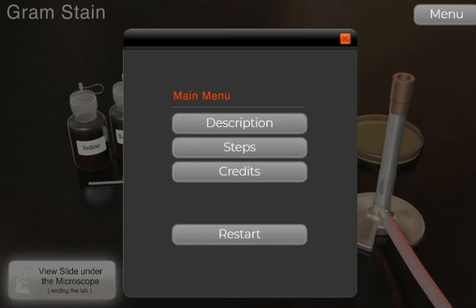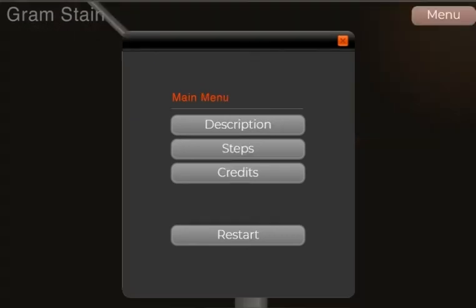Today, I want to explain the experiment of gram stain test, catalase test, coagulase test, and also oxidase test. Now, I will show how to observe gram stain.